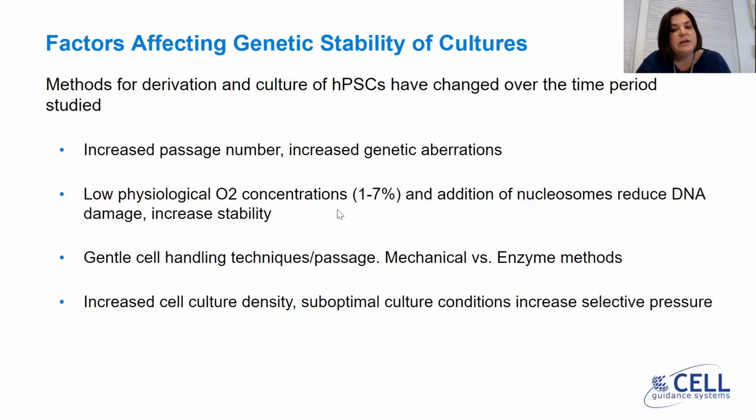Whereas if you increased your analysis up to 50 cells, you would expect to see a clone size of just 6% with 95% confidence. So we do have customers that choose to karyotype 20 cells, but we also have many who choose to karyotype 40 or even 60, just to increase the confidence with which they can exclude mosaicism.